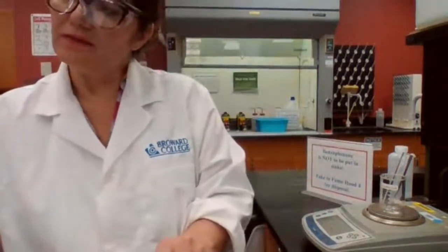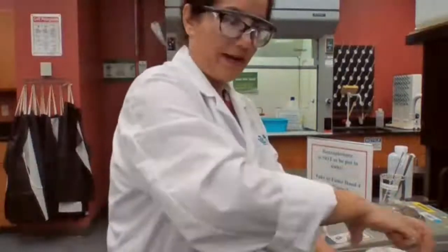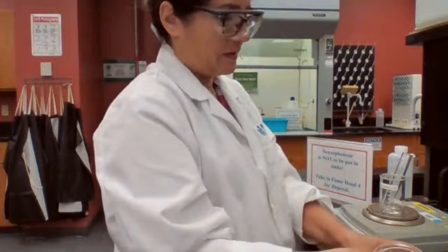Then we need the mass of the test tube with the benzophenone. We want about 10 grams, so I'm just going to add enough benzophenone to make it 10 grams.